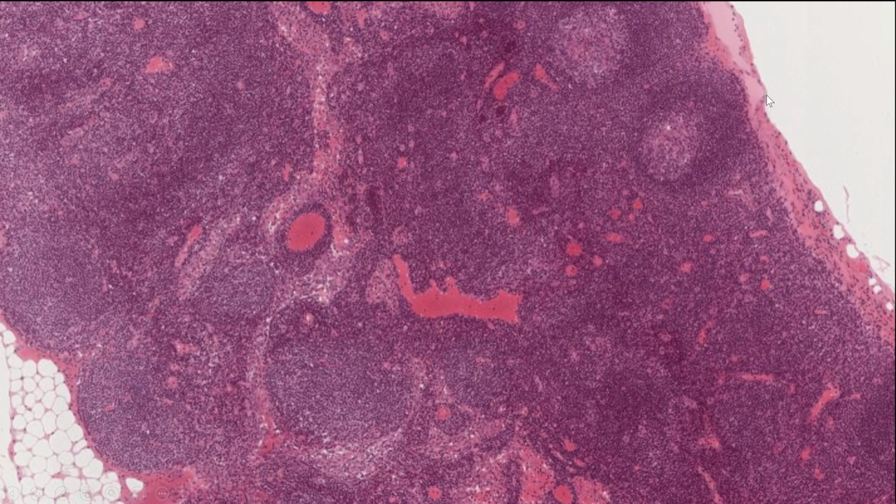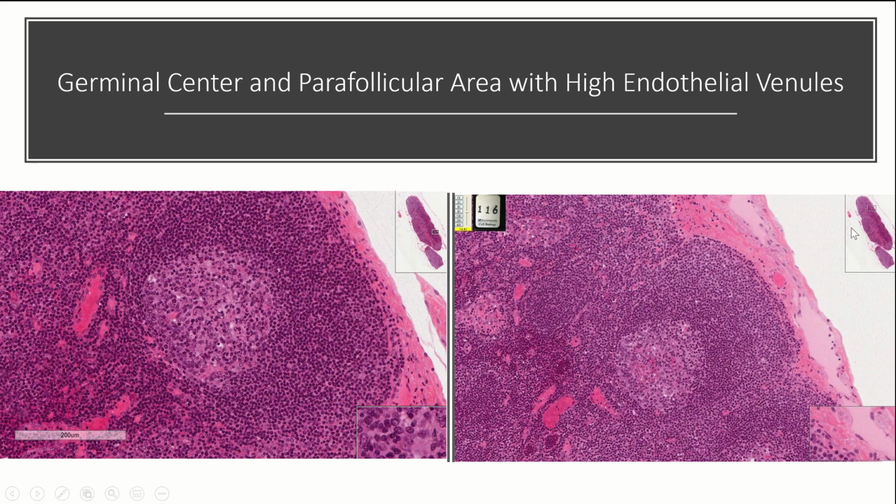In the lymph node, you have multiple afferents and only one efferent. Okay, so there's multiple ways for this lymph to get into the lymph node. There's only one exit. So the one efferent is going to be very big. The little afferents are going to be kind of lined up all around the side.